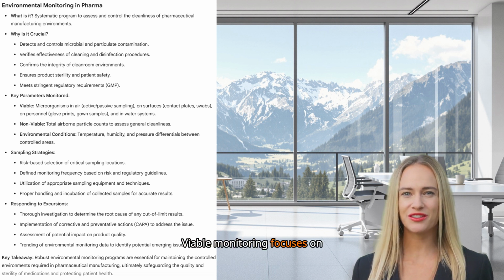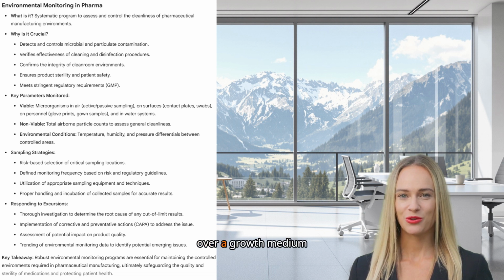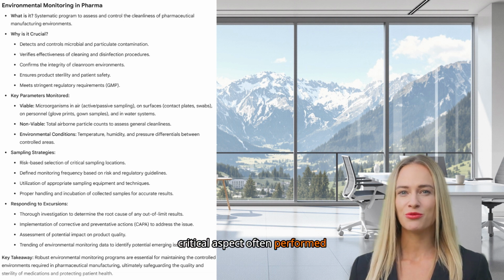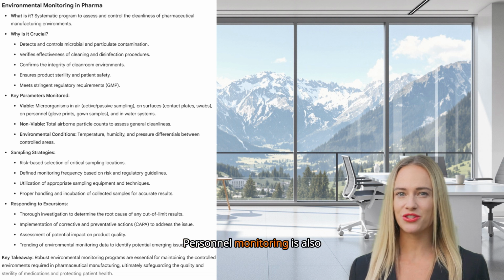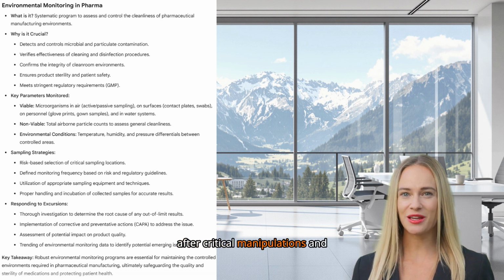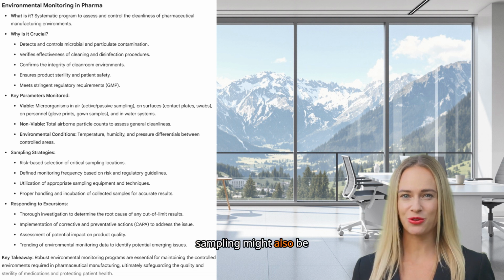There are several key parameters that are typically monitored in a pharmaceutical environment. Viable monitoring focuses on detecting living microorganisms. This includes air sampling, which can be done actively by drawing a known volume of air over a growth medium or passively by exposing plates to the air for a set period. Surface sampling is another critical aspect, often performed using contact plates pressed onto surfaces or swabs that are then streaked onto growth media.